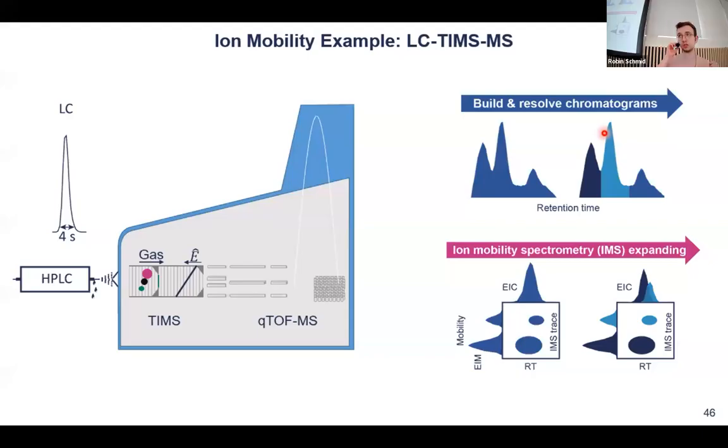Mentioned the IMS data, and some of you also raised your hands when we asked who has an instrument or who has already worked with ion mobility data. Most of my PhD I've been working on implementing ion mobility support for MZmine. First of all, have you heard of ion mobility separation before? If you haven't, please raise your hand.